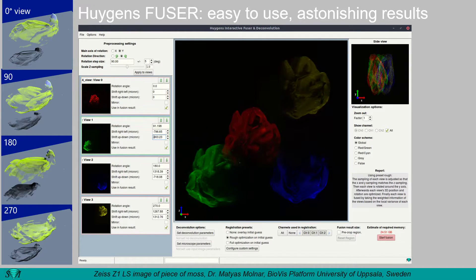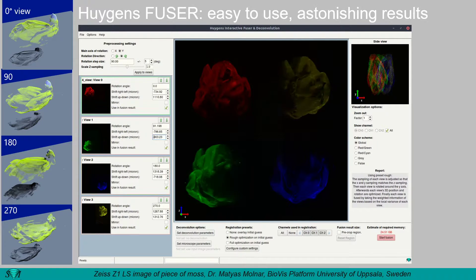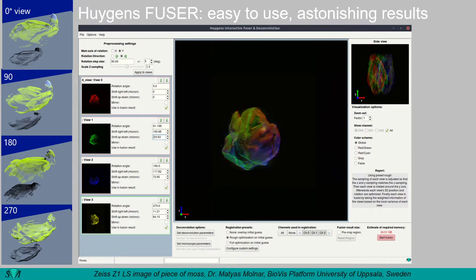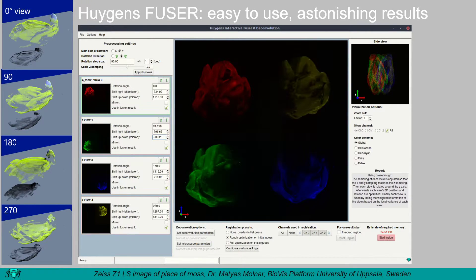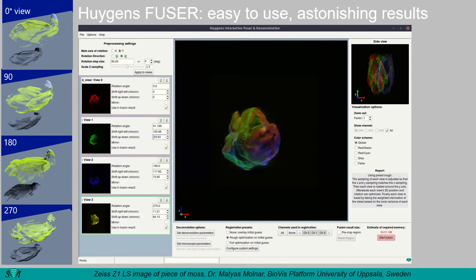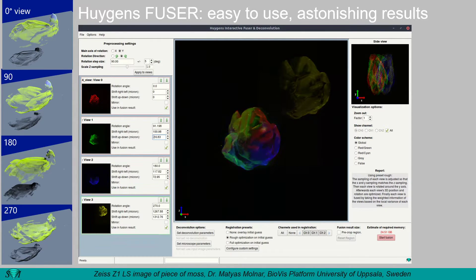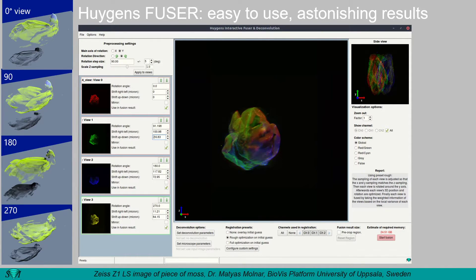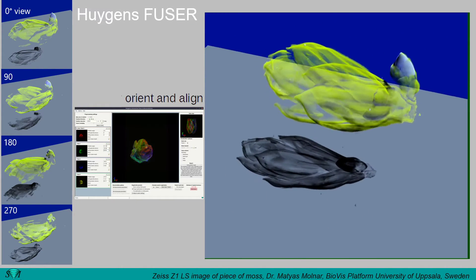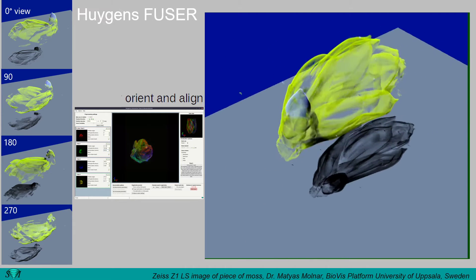In the Fuser tool, multiple rotational views can be combined. The tool works in an interactive way, where the views can be approximately aligned manually, and their relative position and orientation will be fine-tuned automatically. When the images are aligned, the best parts of each view can be combined into a fused image. The single fused image of this piece of moss is rendered on the right.